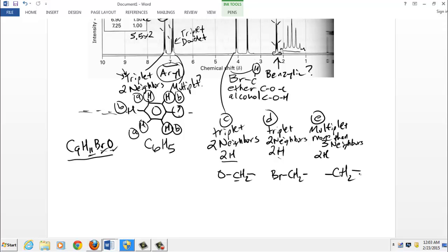And I stare at this a little while and realize these are kind of like puzzle pieces. The benzene ring has 1 more spot to connect the rest of the groups. And so does this group. There's just 1 more bond to connect. Same is true for this group. 1 more bond to connect. Sorry, I was missing one. It's like, how am I going to get all these together? This group has 2 bonds. Oxygen. Oxygen makes 2 bonds. There we go. Okay, so this one has 2 more bonds to make.